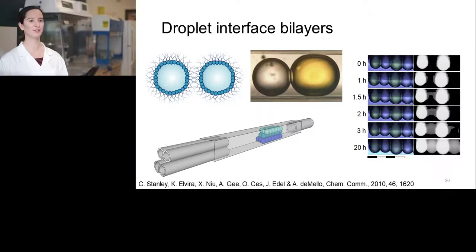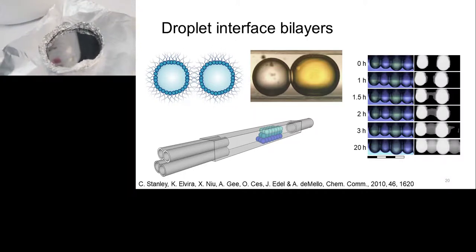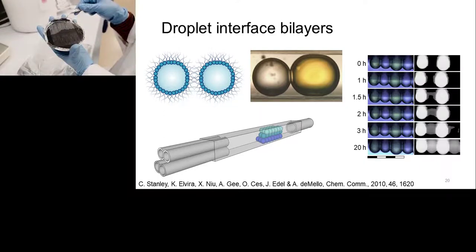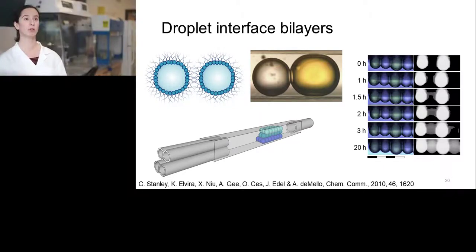So the best way to visualize microfluidics is to think of a tiny little piece of plastic around the size of a postage stamp. And imagine on there you can build tiny little pipes and little chambers. Think about the width of a human hair, so really, really small. And we use them to do chemistry or biology on really small scales.